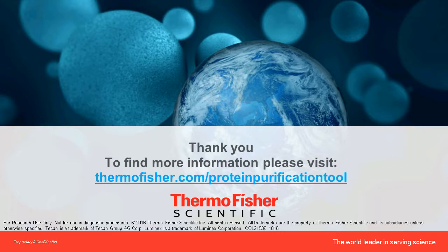Excellent. Thanks, Bhavin. And our next question asks, can you elaborate on why protein A/G beads are not suitable for immunoenrichment of target proteins from biological fluids? Because biological fluids have a lot of immunoglobulins as a part of the matrix, and we know that protein A and G will bind to a lot of those immunoglobulins, so there will not be enough binding capacity for the antibody that you are using and for the target.